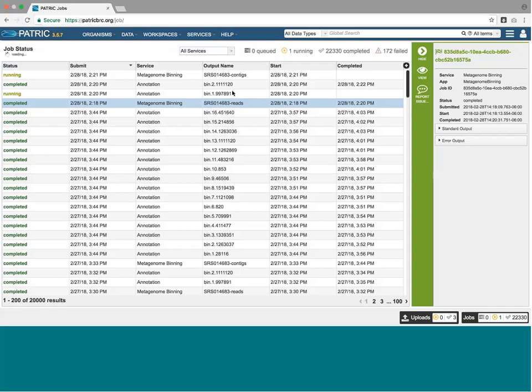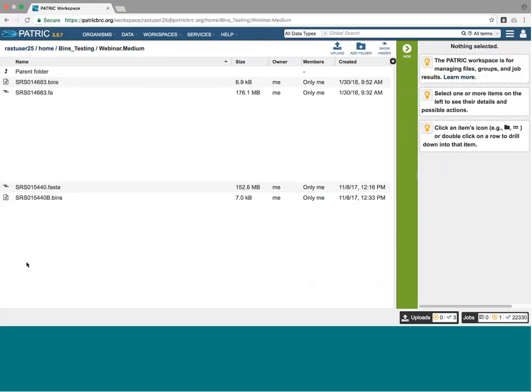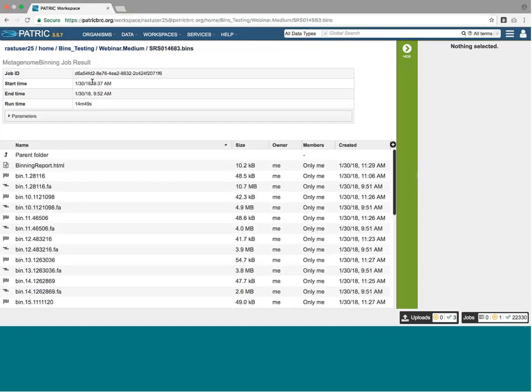All right. So we have submitted our binning job, and the results will come back in our workspace. Now, a while back, I ran a job just for this webinar so that we'd have the results ready. And here you see I told it that I wanted the output to be called SRS014683.bins. And when you look at this, this is actually a folder, and it's full of files.